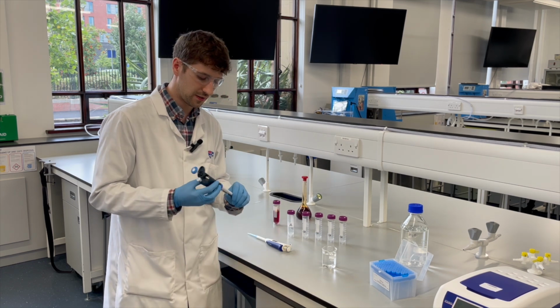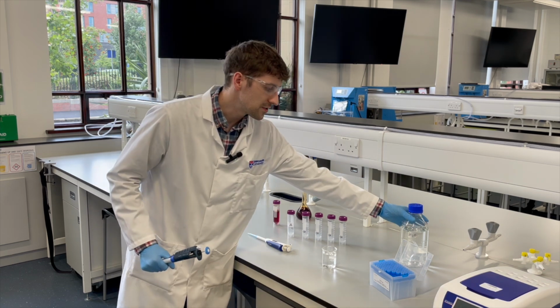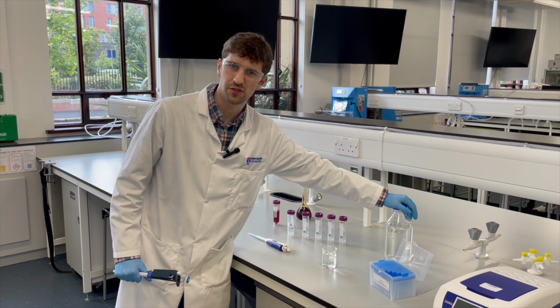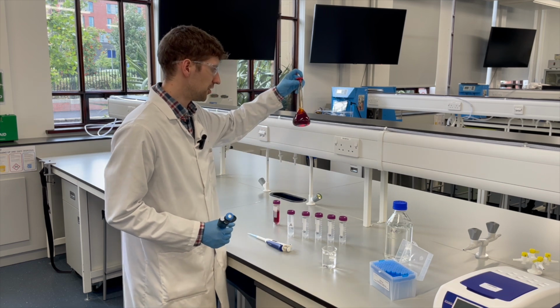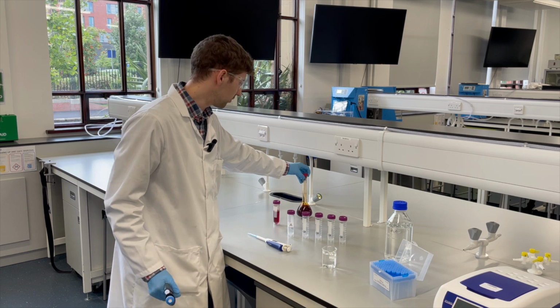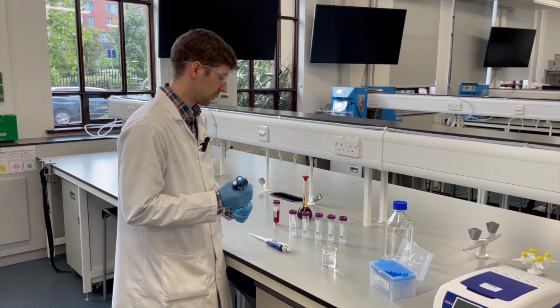Using our equipment, what we need is a pipette. Of course, we need a UV spectrometer. We need some diluting agent. In this case, I just use water. You want your diluting agent to be something that your drug or compound is going to be soluble in. In this case, our food dye is made up in water. We know it dissolves in water, so water will work just fine. And we need some vessels as well to dilute up our substance.